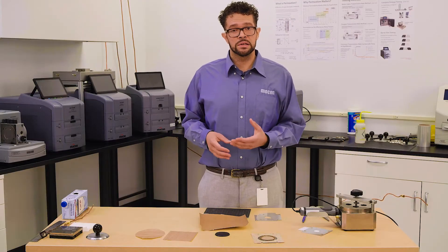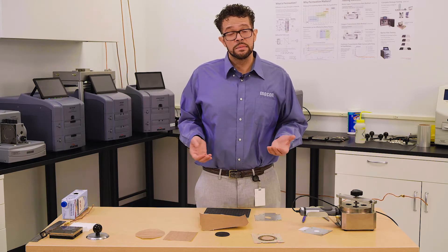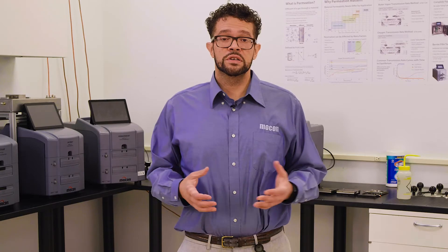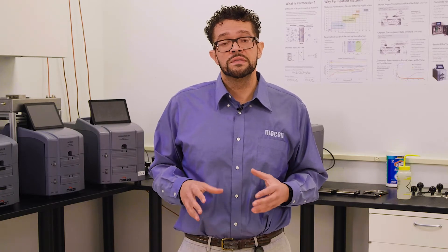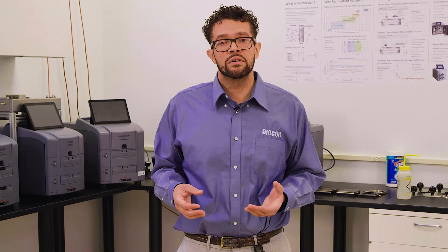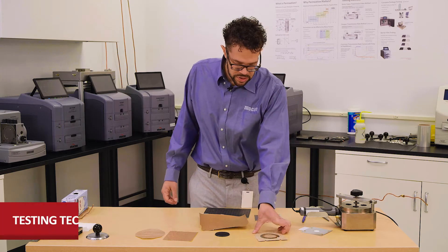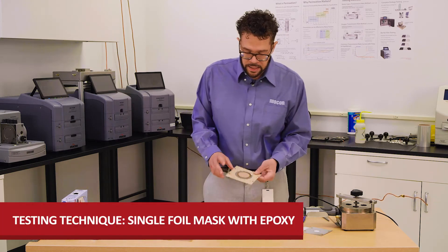The first technique we use in our lab is the most popular way to test paper-based films and structures — we physically seal the edges with epoxy. We don't allow any ingress to come in from the atmosphere, and we don't allow anything passing through our film to escape through the edges, because it works both ways: things can come out or come in through the edges. We call this the single foil mask with epoxy technique.